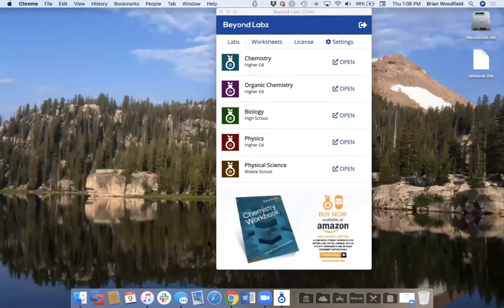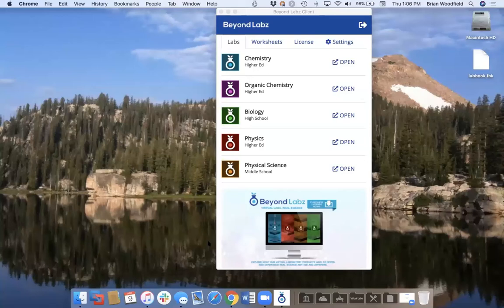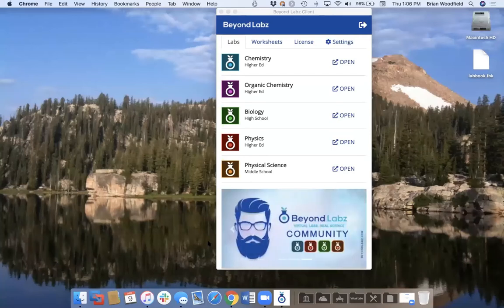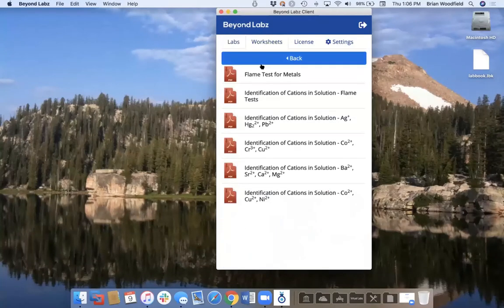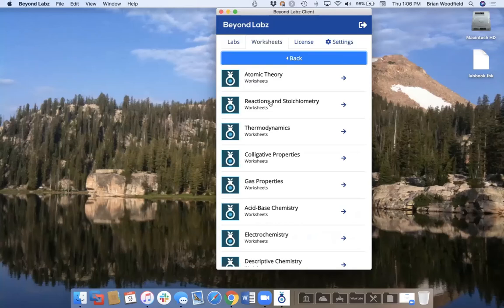And actually the first version of the workbook was like 600 pages long because we added so many different kinds of experiments and it was so expensive and daunting that they asked us to reduce it to our favorite 80. So these worksheets right here for higher ed general chemistry in these categories number about 80 of them, but they're only a small fraction of all the experiments. These lab activities worksheets don't cover even close to everything that it does. These are just basic classic experiments.